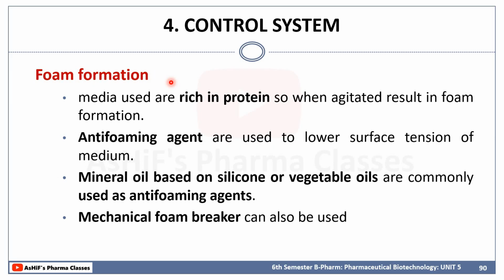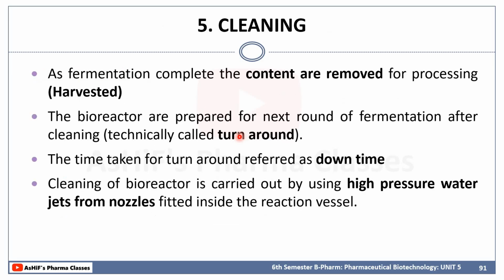And finally, the foam formation. Since we are using proteinaceous materials or media, and also we are performing the fermentation in aerobic condition, sometimes there will be a formation of foams. So we can reduce the foam formation by using anti-foaming agents like mineral oil, silicone, or vegetable oils, or by using mechanical foam breakers.